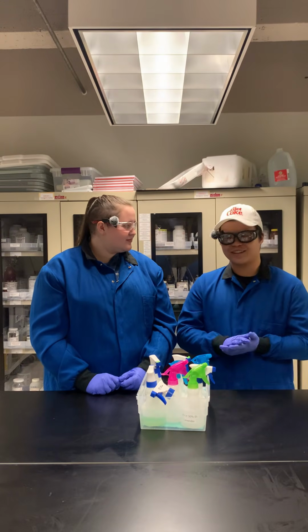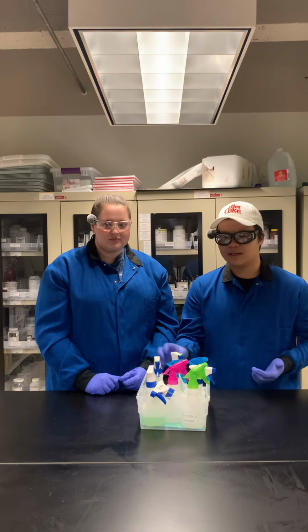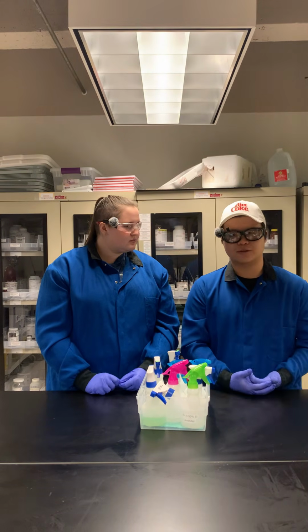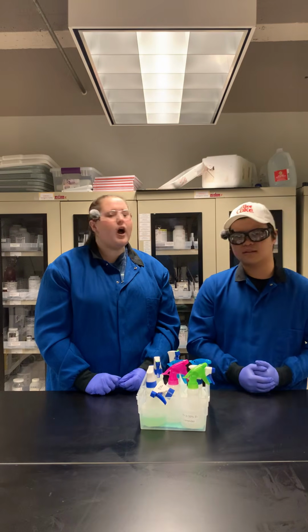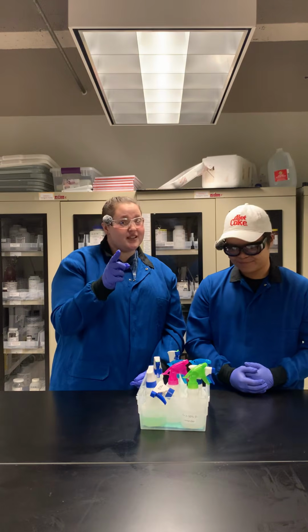Well, hold on a second. Not all metals will react the same way. Some metals can be really dangerous to burn. Additionally, some metals will also not emit light in the visible spectrum, so that means we can't even see it. Oh, okay. I guess this means I'm not going to try this at home. And you scientists shouldn't either.